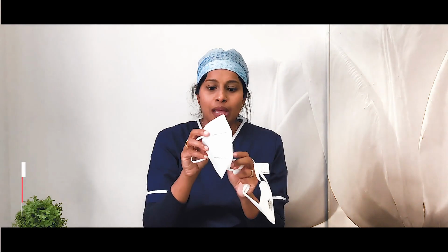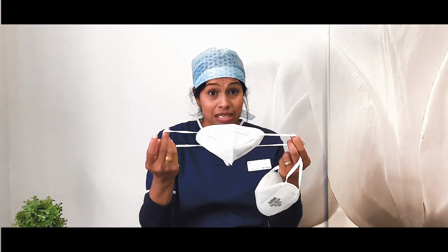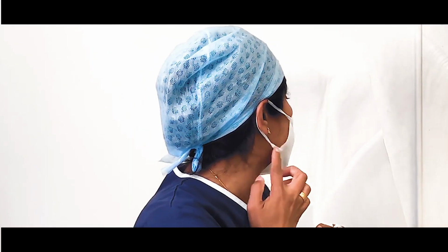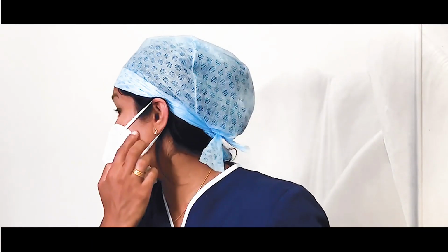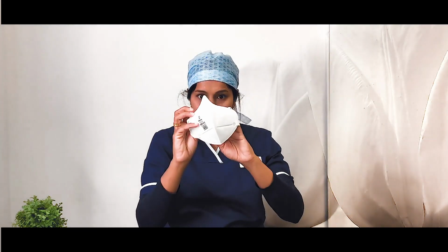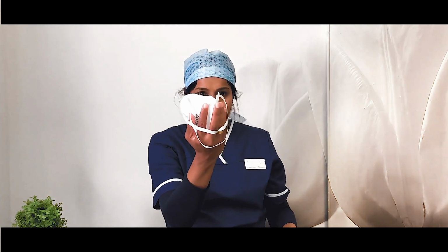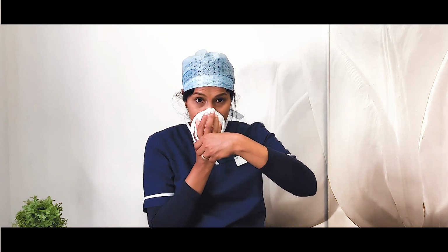These can also come as ear loops, very similar to a surgical mask, and it just goes on. But if you check, the seal is actually very good when you compare it to a surgical mask. Or it also comes as head loops, it goes on the head. So how you wear it is that you hold it with the headpieces hanging down, and then the wire bit goes on top.